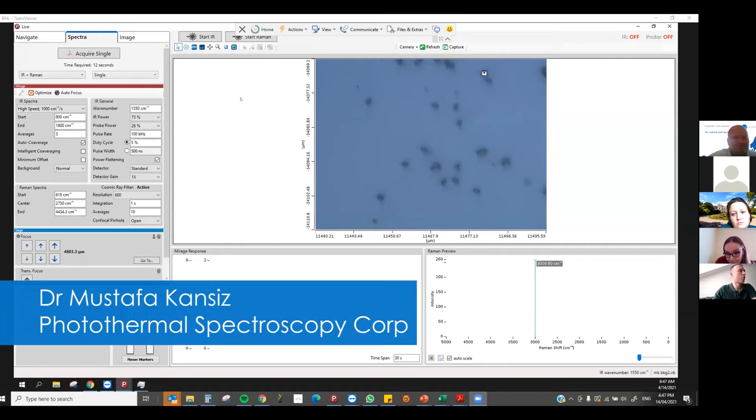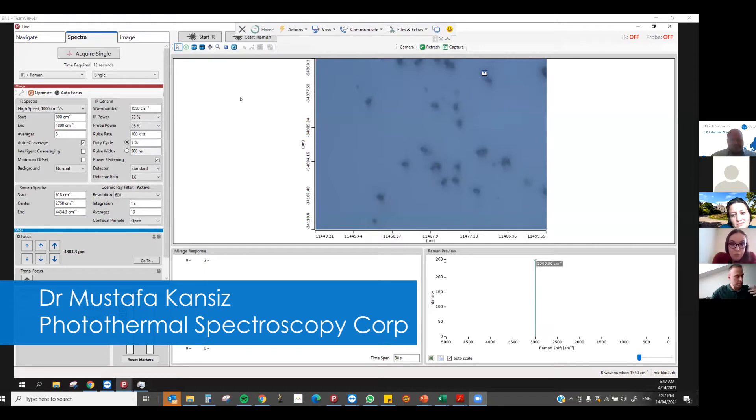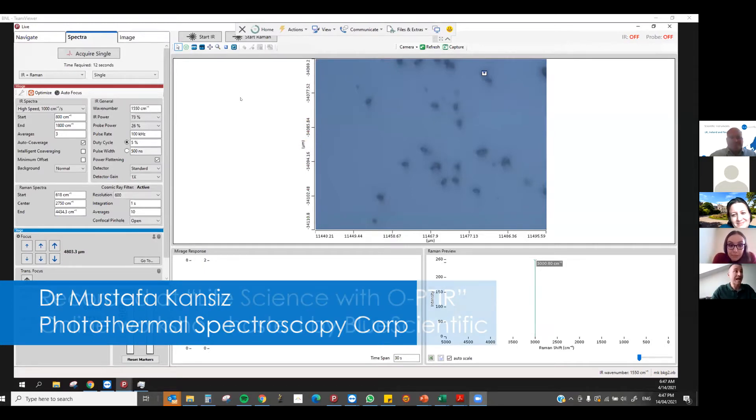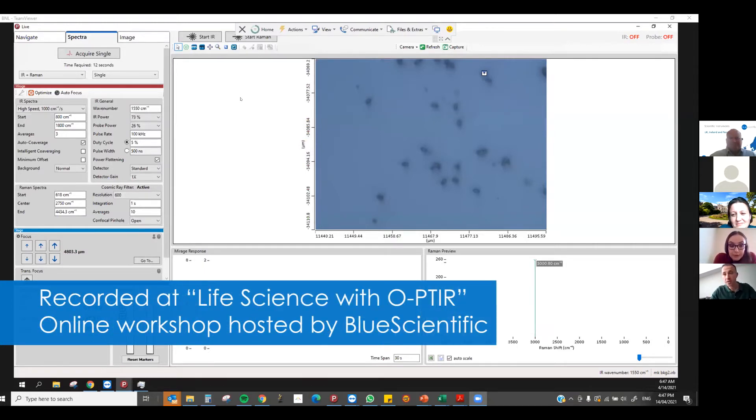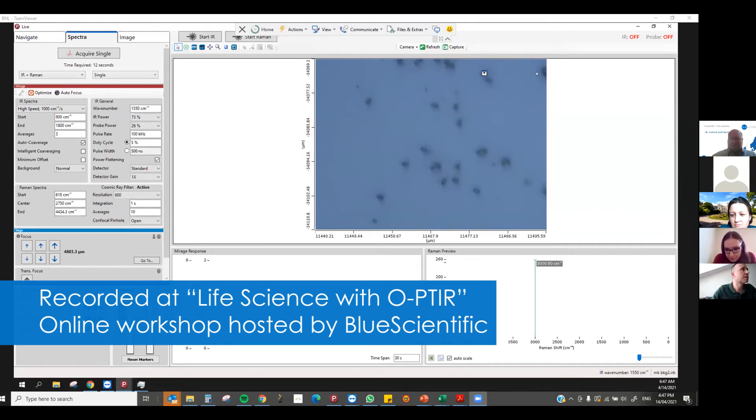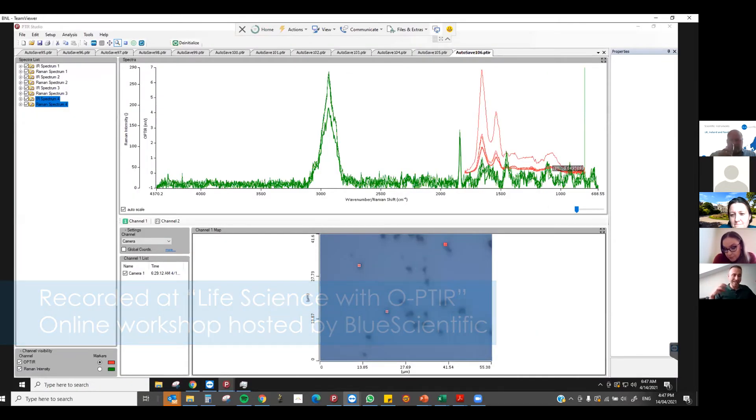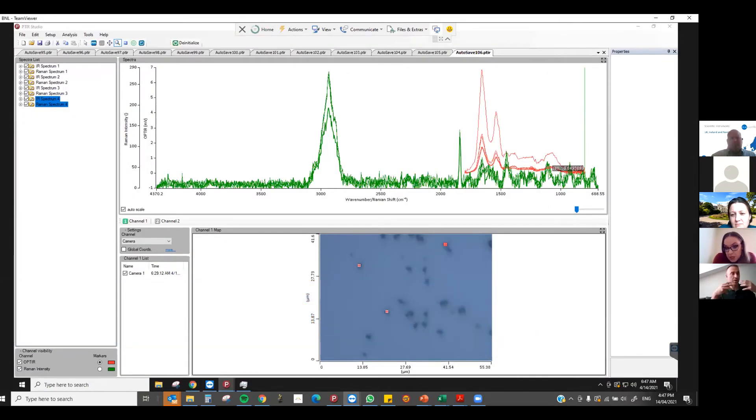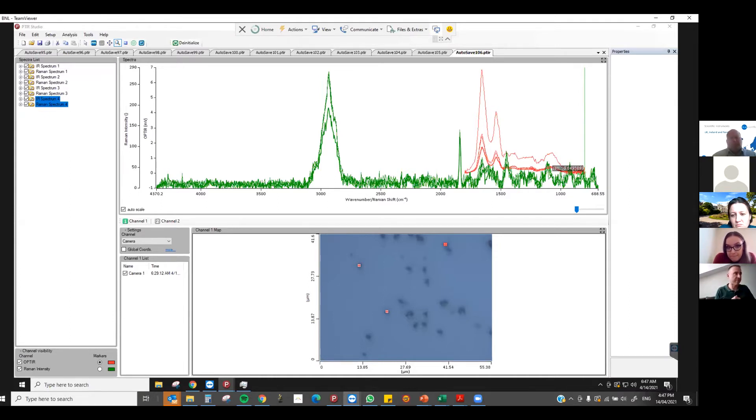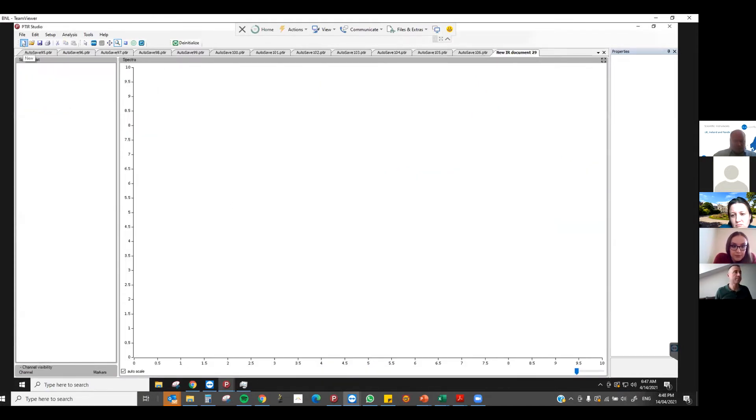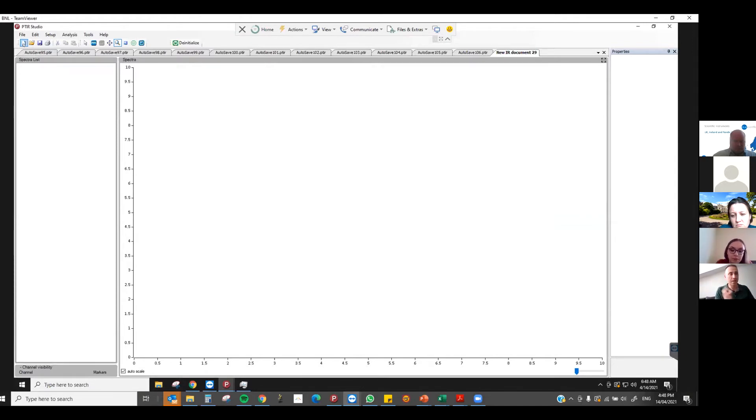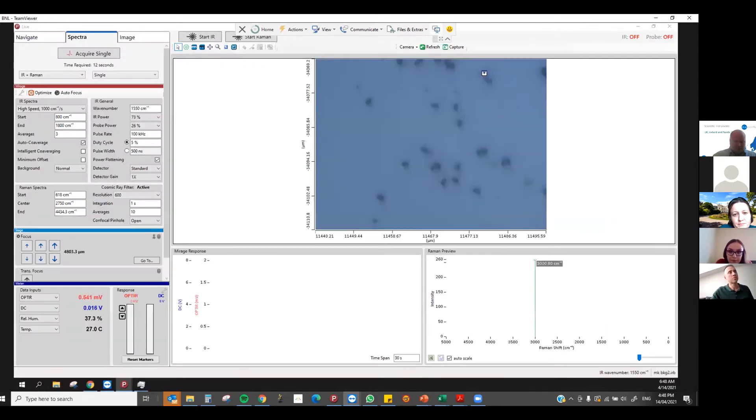Okay, let's have this a bit more informally. Imagine you're standing around me and I'm using the instrument. Feel free to ask me to do something. Let's get straight in because we're running out of time. I'm now dialed in. I'm sharing my screen here. I'm in Europe but I'm connected to an instrument in Santa Barbara, California. We have a dual monitor setup on all of our systems. On the left monitor, which is what you're seeing at the moment, is where our data is sent.